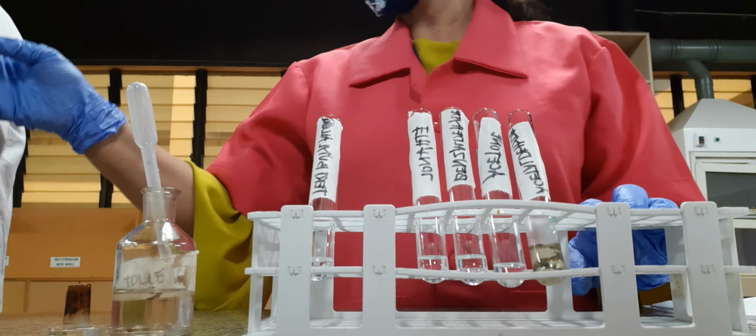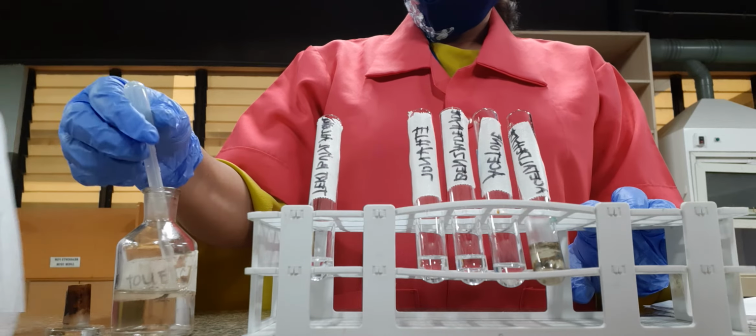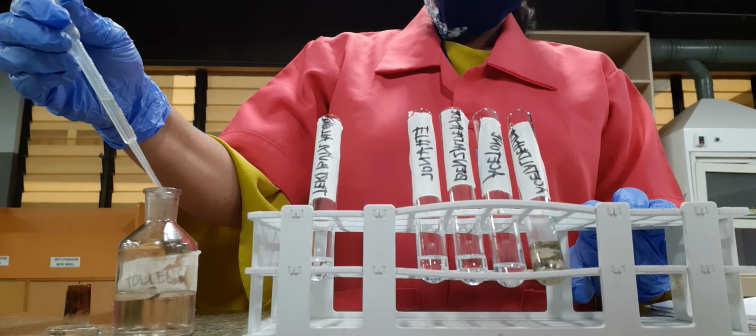Ay, ang atong kuan. Bunsen burn ang water bath. Gamit burner, miss. Oh. Silver meron.